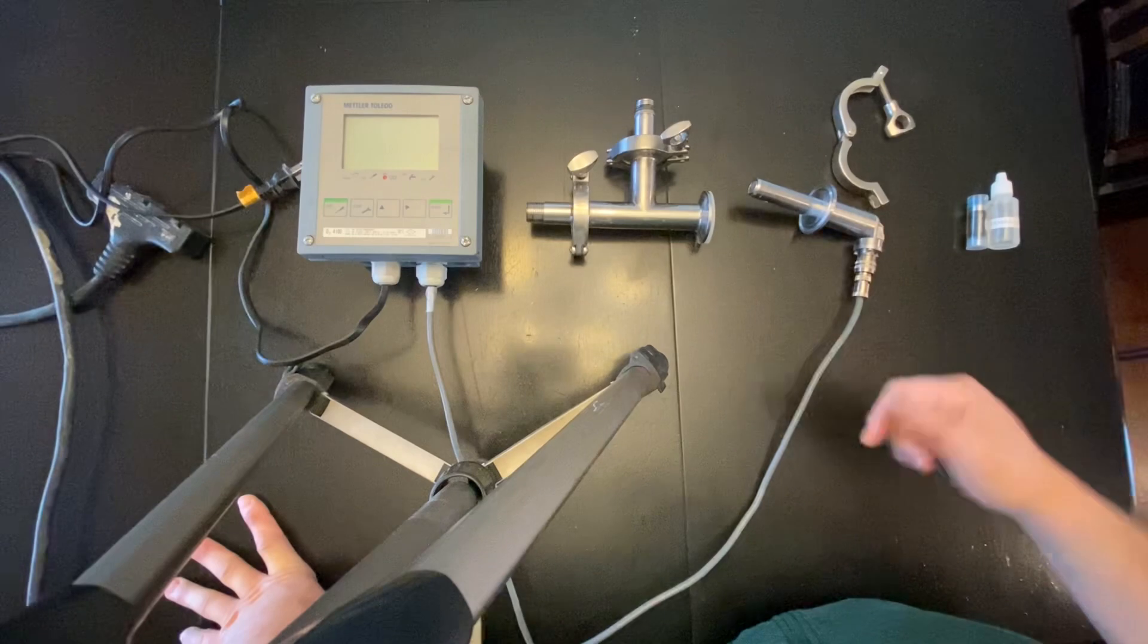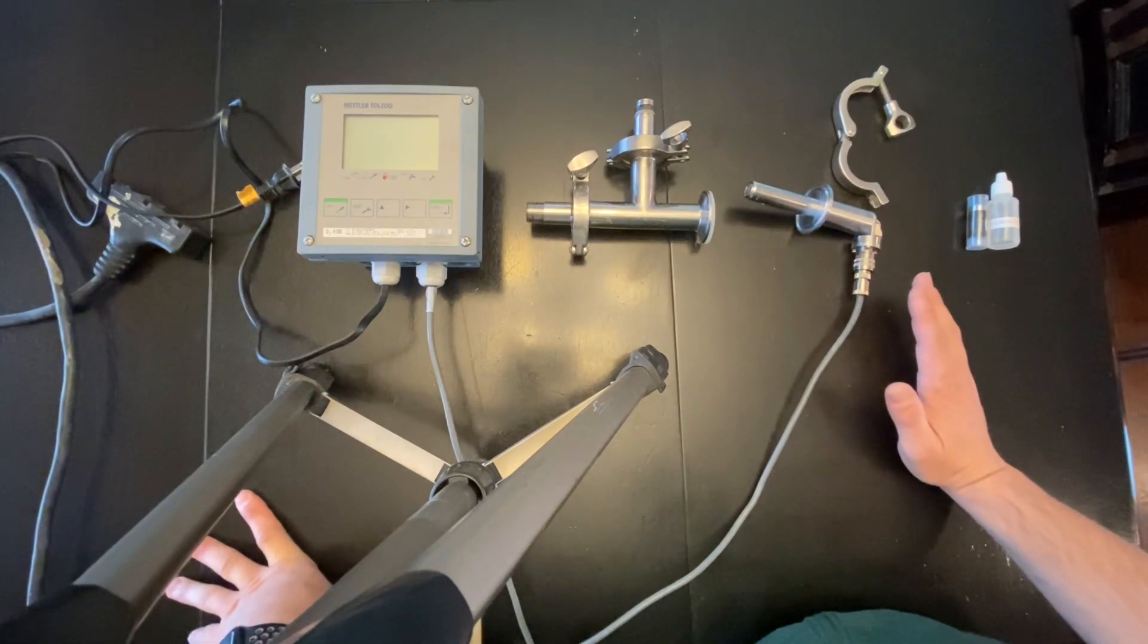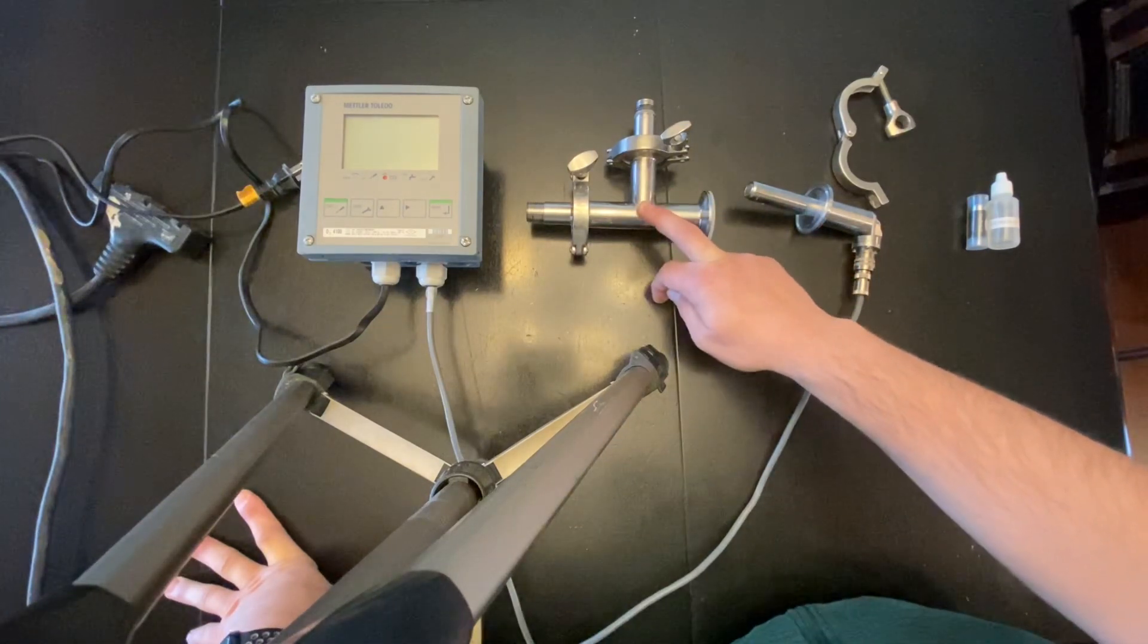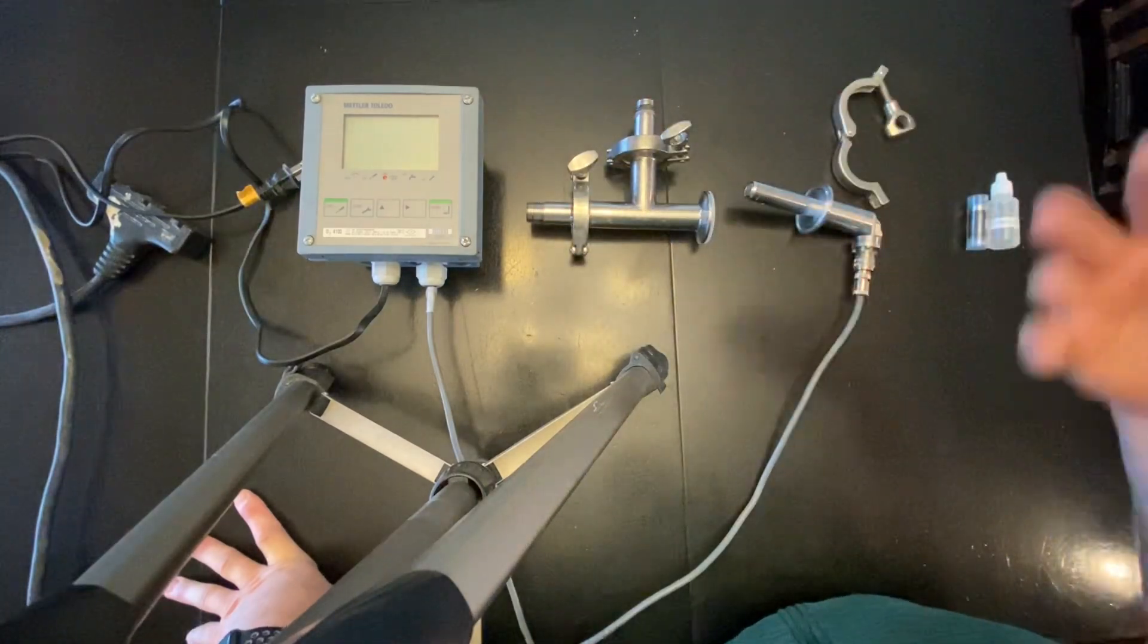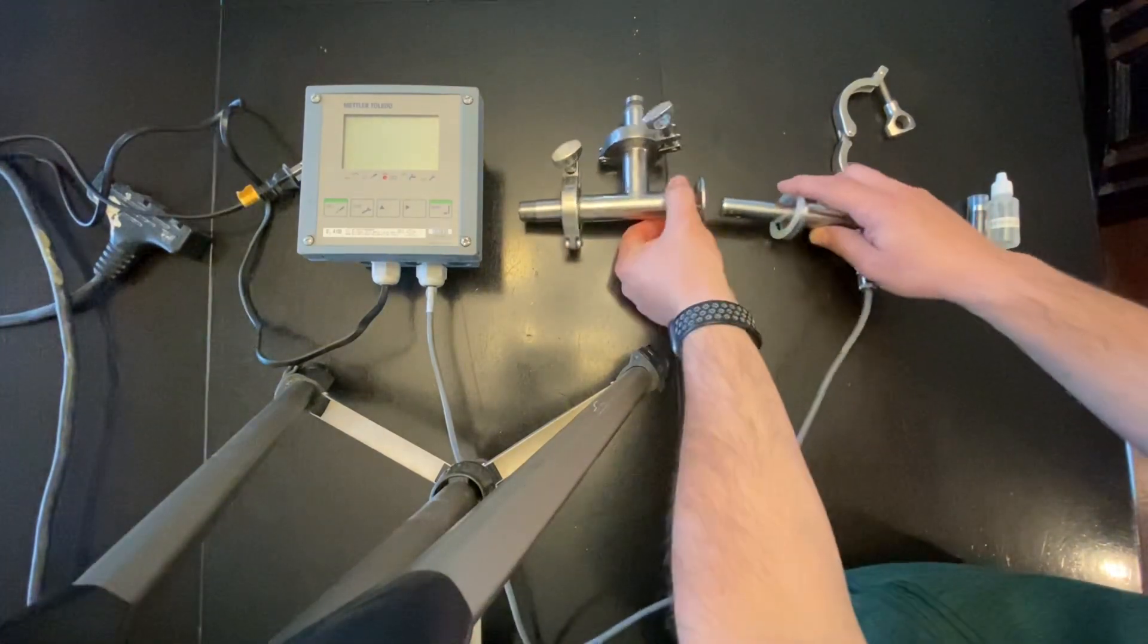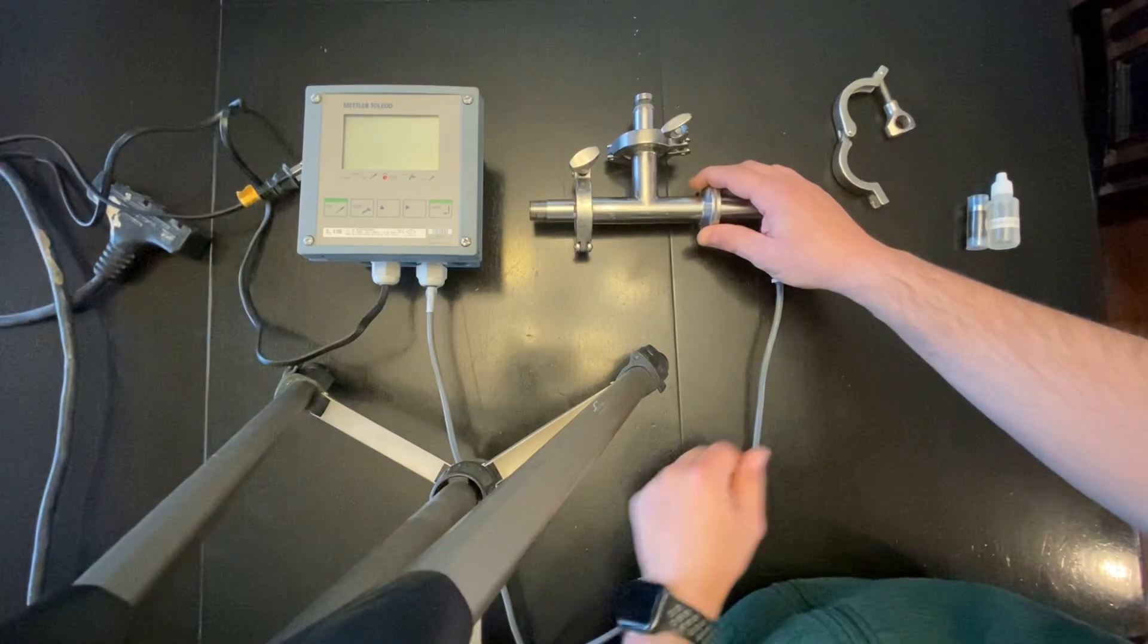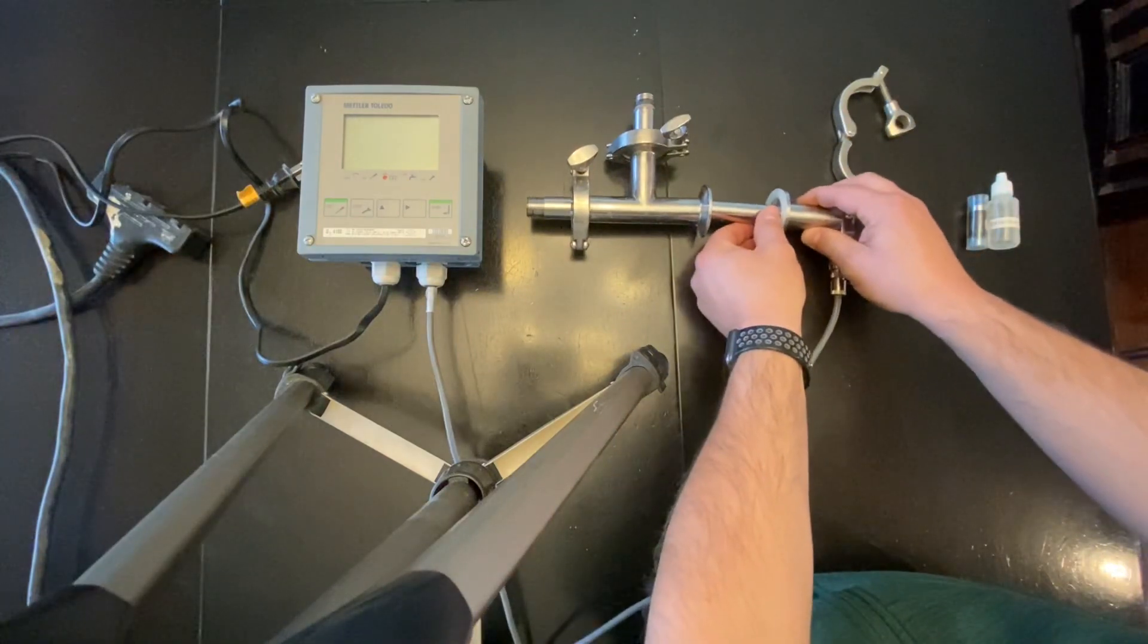Since this is a sanitary fitting, I realized that not everybody has tri-clamps or sanitary fittings, so what I will be including is this T. This T has some MPT outs, so with that you should be able to adapt this to your system. The DO meter itself just fits right into this T and it extends right about here so you can get an in-process measurement. When you're oxygenating, you can just dip this in your wort or recirculate with a pump or however you want to do it.